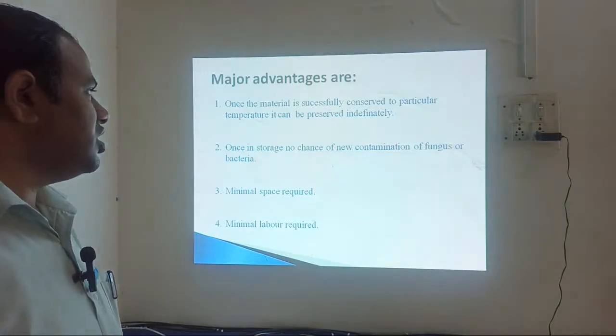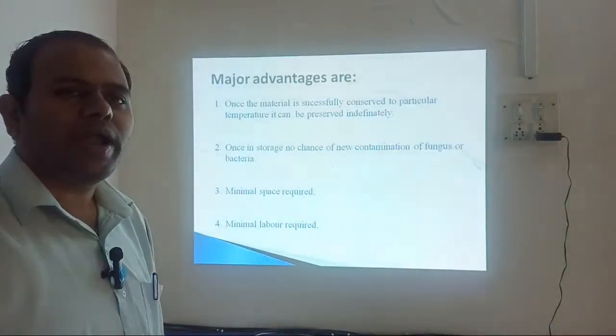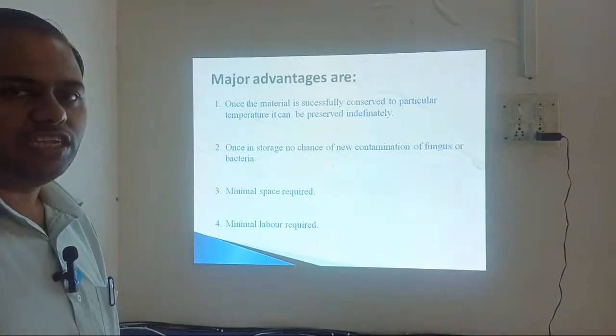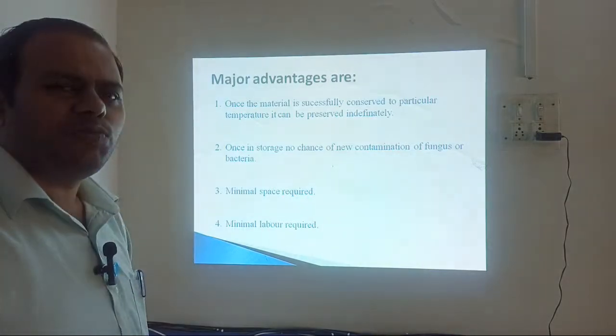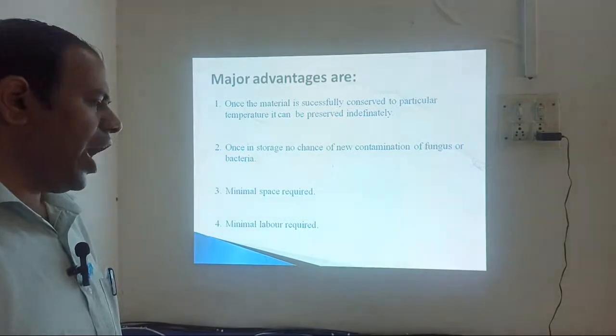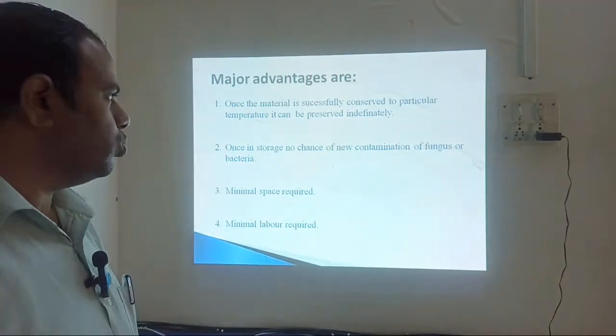Once there is storage, there is no chance of contamination, because fungal or bacterial contamination cannot occur at such low temperatures. So therefore it is very advantageous. And minimal space is required, only a cryo container and cryoprotectant are required, and minimum labor is also required, because a single person can easily do this kind of preservation.